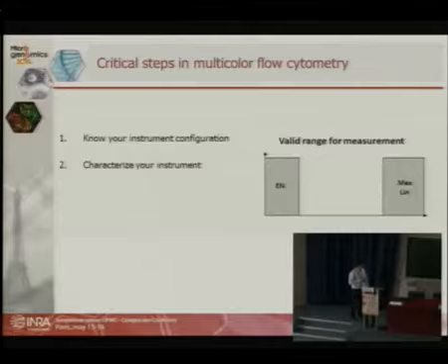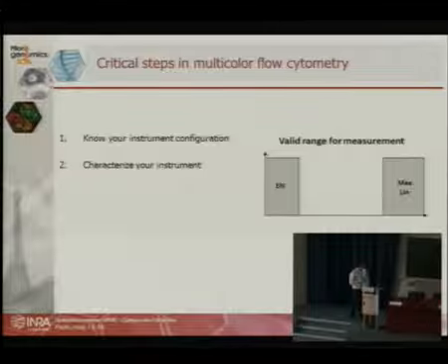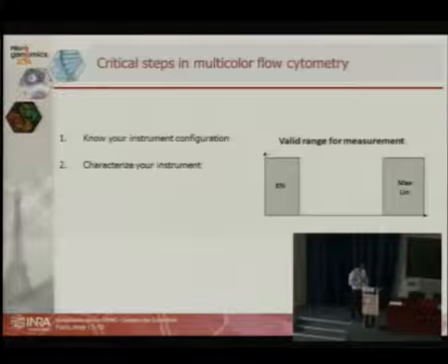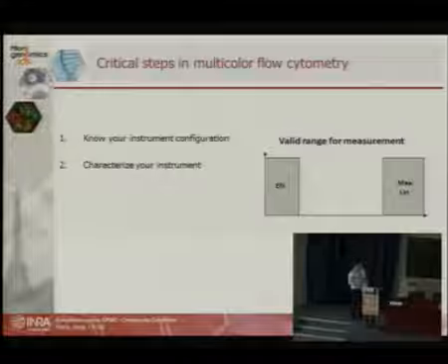And you have another one which leads to very drastic errors when you set up a compensation matrix. That's the maximum of linearity of the PMT, and you should also not be in that range. And most of the time, people don't know how to look at that. Actually, most of the platforms that do flow cytometry, they quality control their instrument every day. So you just have to go to them and ask for the data.